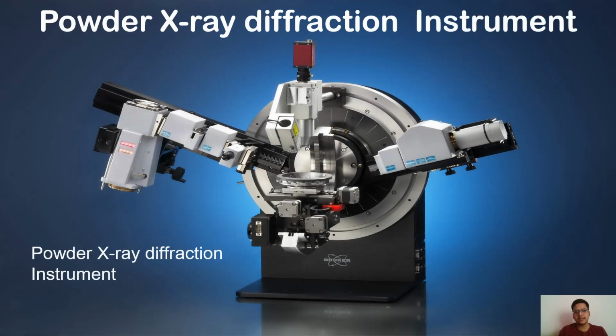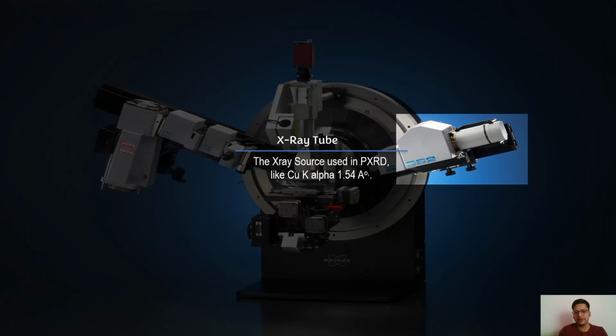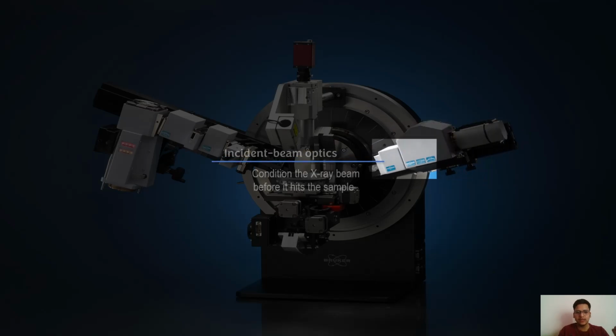So this is how a PXRD instrument looks. Now let's dive into it to find out how the different components look. The first component that we need to focus on is the X-ray tube. The source here is copper. Copper can release many types of radiation like copper K alpha, copper K beta. Depending upon what we require, we can use an incident beam optics, which gives only the requisite beam according to our input.